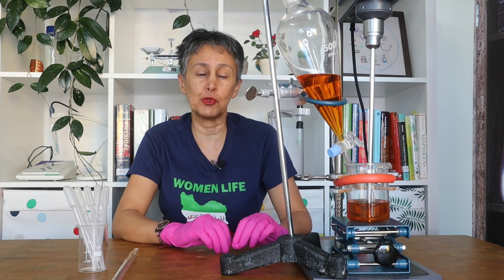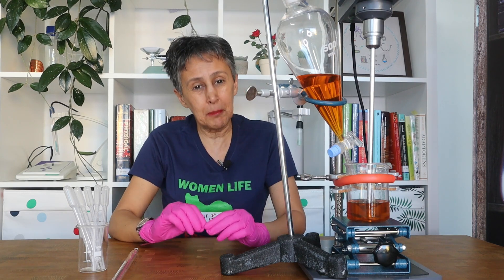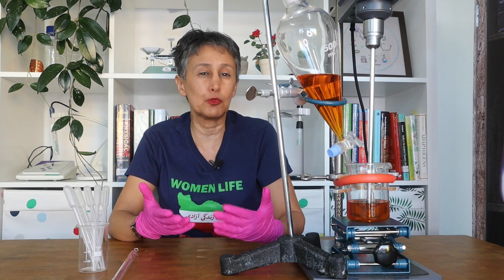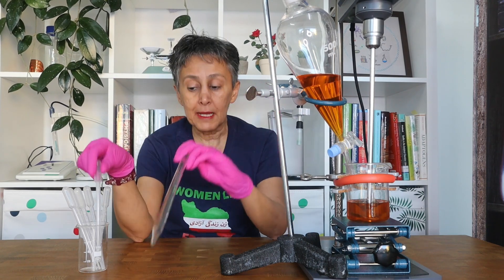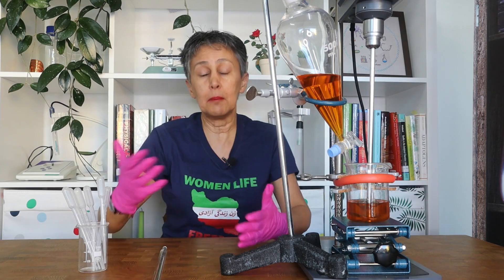For small batches and for laboratory batches of 100 to 500 grams, you can use a pipette like this or like this, but it is very time consuming. Of course, for bigger batches you have to find another solution.